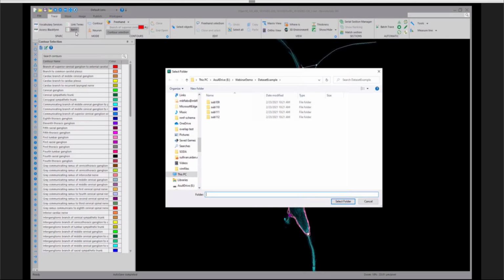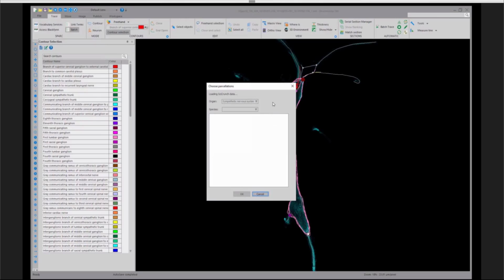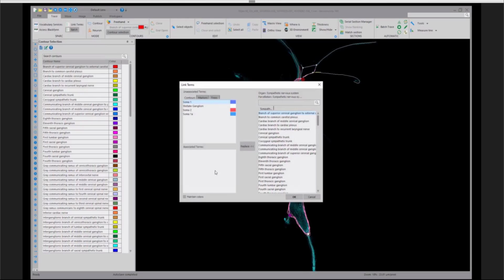We have recently developed the batch process for the linked terms workflow, allowing users to select a folder containing many data files that are similar to each other and associate those elements within the data file with the FAIR terms from the SciCrunch database. This tool helps deal with big backlogs of data from a whole experiment and makes those data files FAIR and consistent all at once. And you can see on my screen, the process looks exactly like the linked terms, but it's going to show you all of the data elements from every data file you selected to open.